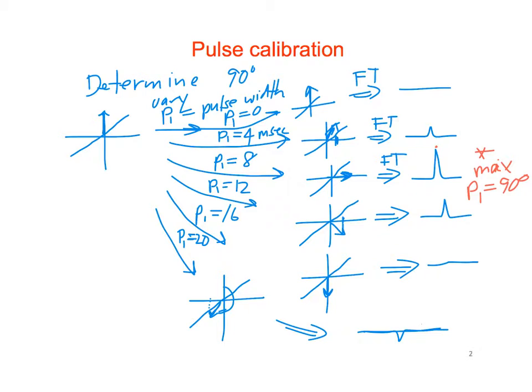They would precess at different frequencies and relax at different rates, but I think they all have roughly the same 90-degree or 180-degree pulse. If not, we couldn't manipulate all the spins from the molecule at the same time and do a more complicated experiment.